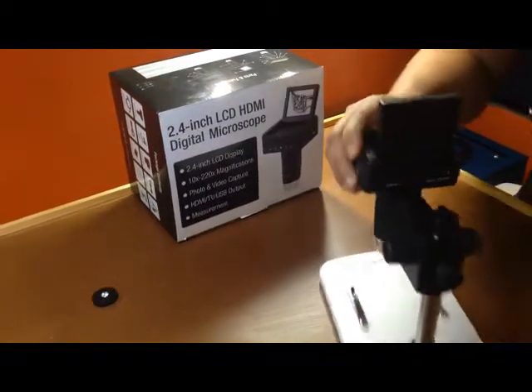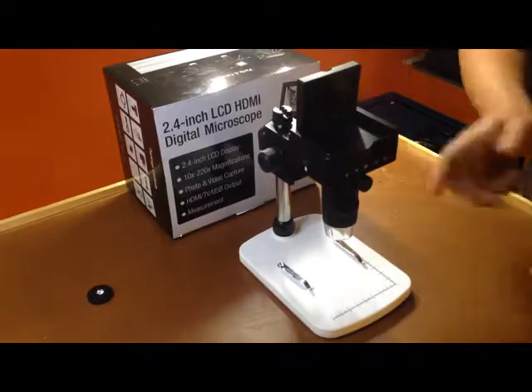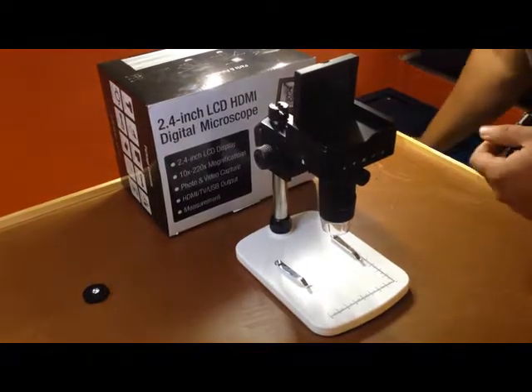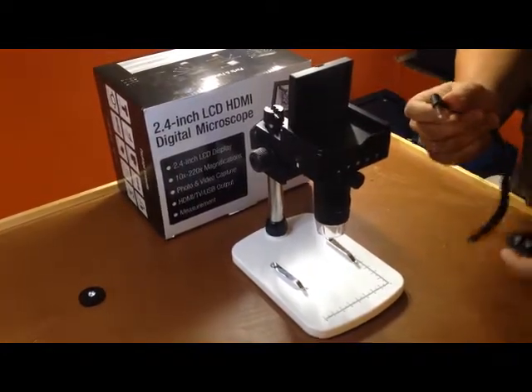Cables are supplied with this particular scope. The scope has a rechargeable battery — it's a 5 volt battery. It also has an additional feature where you could hook up a remote to make it easier for taking pictures.